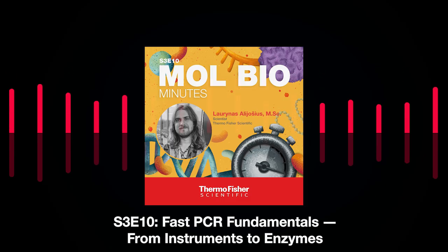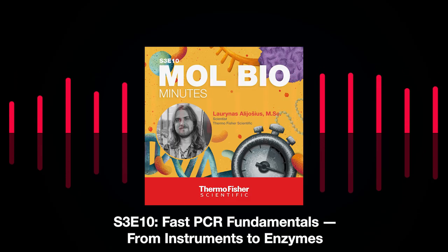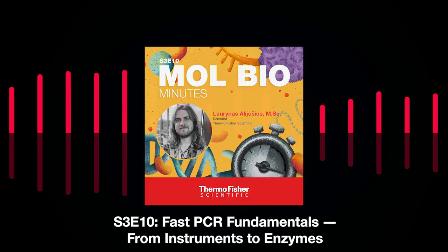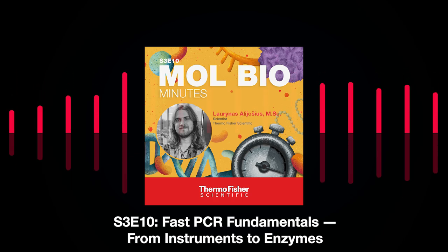Let's jump into it. First thing that we can optimize could be the amount of the DNA polymerase that you use for your PCR reaction. This thing depends on the specific DNA polymerase. So let's say that both increasing or decreasing the amount of units can improve the efficiency of your PCR.